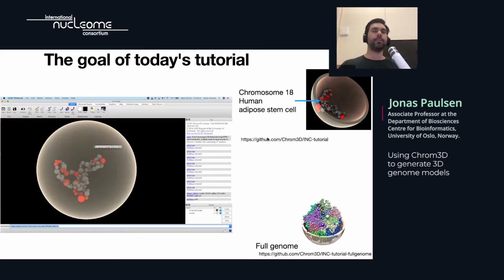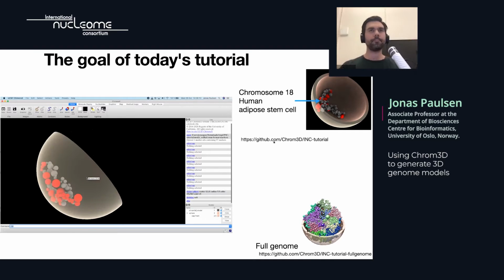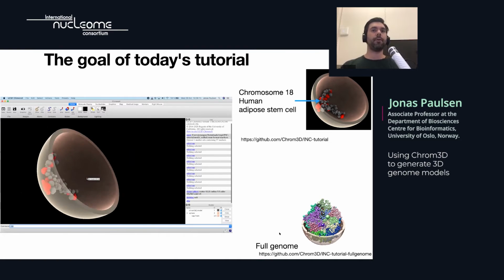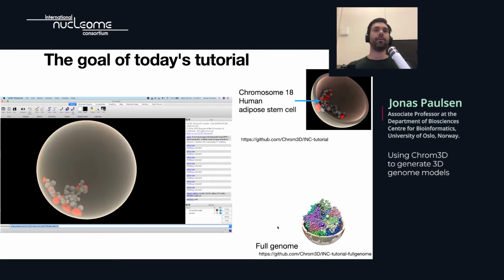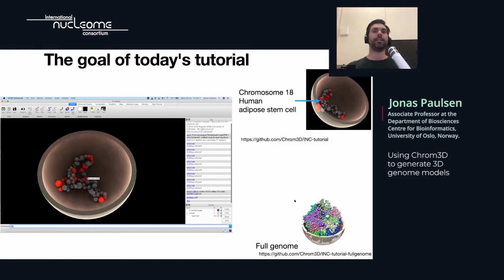Today's tutorial will actually use a GitHub page that I'll give you the link to later. There is a full genome version of the tutorial that I'm going through today. If everything works fine for you, you've installed all the programs and you can easily manage today's tutorial, I'd recommend you go in and try the full genome version, where you can actually model the entire human genome. But that's on a separate GitHub page that you will get the link to later.